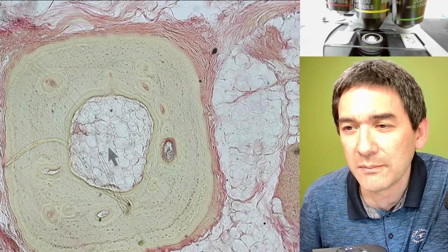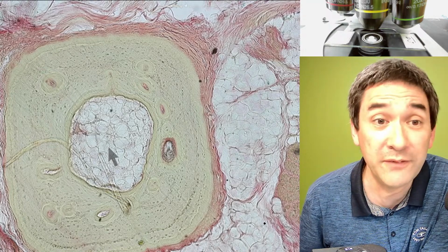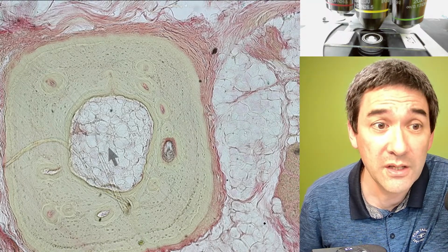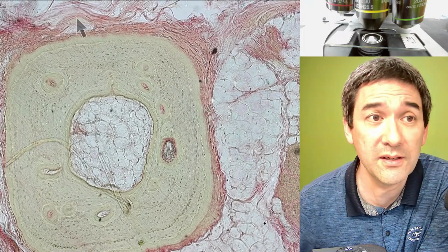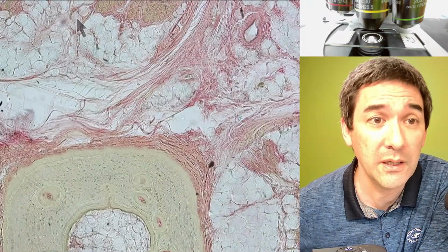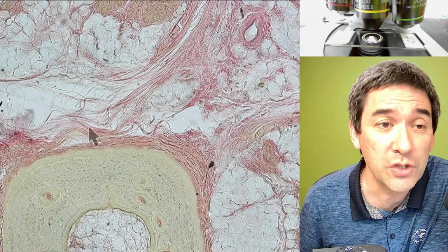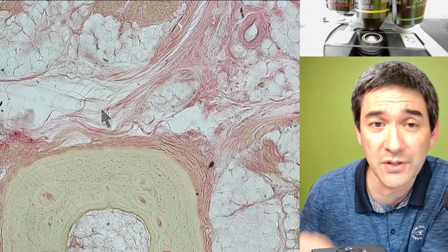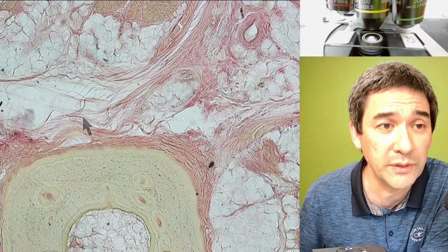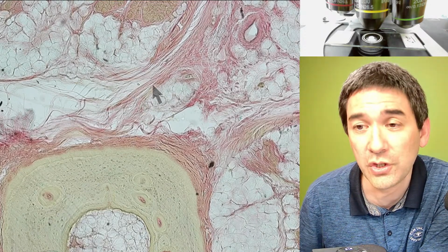Lots of cells in the muscle. Some of that probably connective tissue as well. Yes. So for example, these things that you see here, those wavy things, most likely connective tissue. Connective tissue is made of collagen protein, and these are very strong fibers. And they often run in parallel fibers, so this could quite well be connective tissue as well. Yeah?